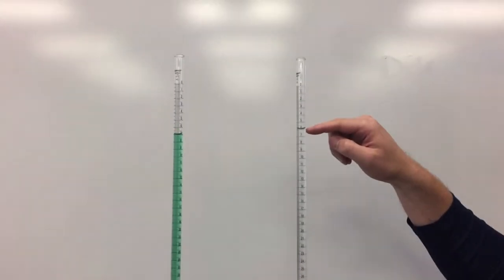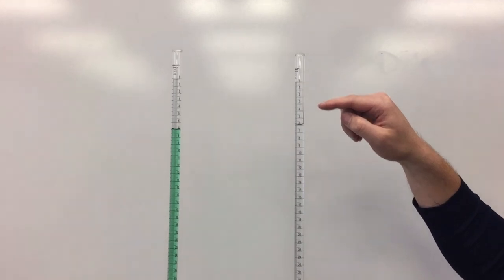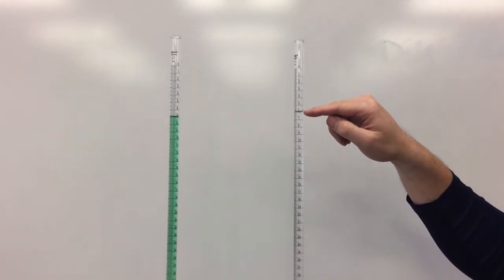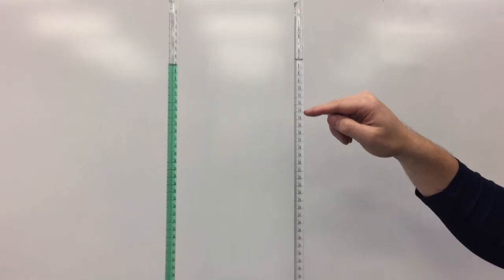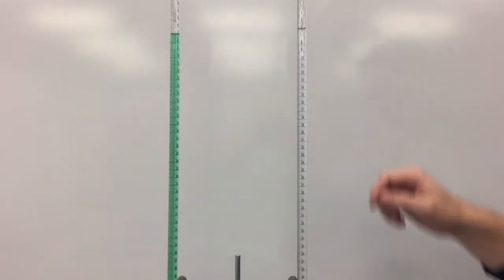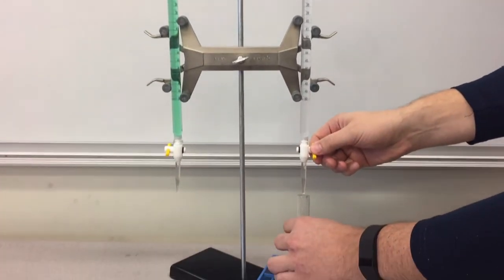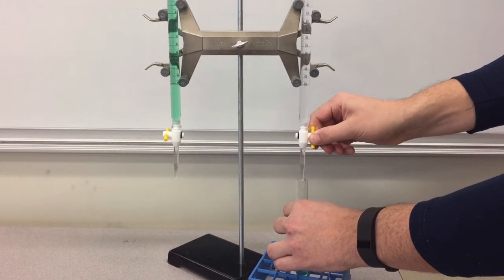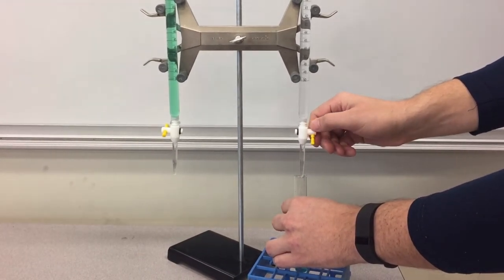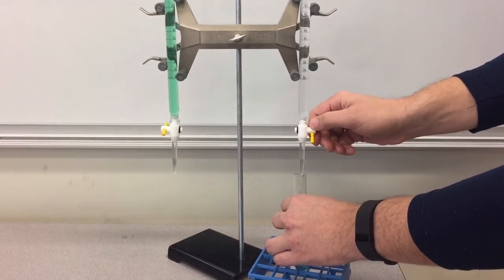Then we'll use the burette containing the water to deliver about 6 milliliters of water, bringing the total volume of liquid in the test tube up to 10. After we've delivered 6 milliliters of water into the test tube, we'll take a final burette reading and record this in our notebook.